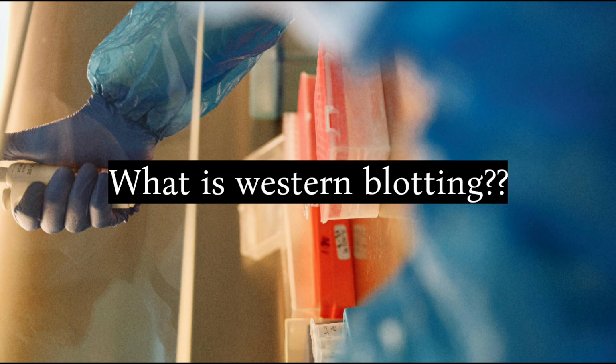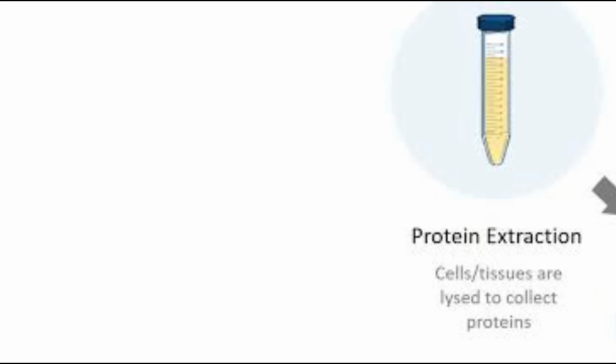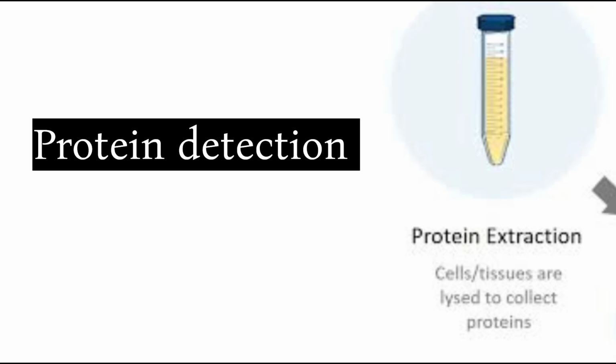So welcome to Biomanscape. Today we are going to know about Western blotting. It is also known as immunoblotting and it is a laboratory technique used to detect specific proteins in a sample.